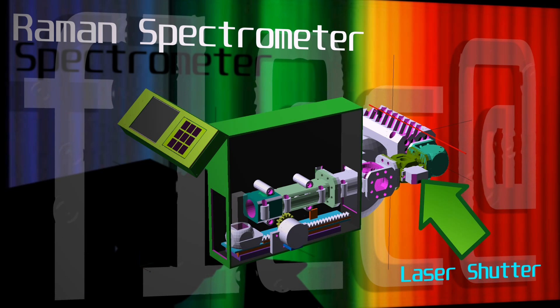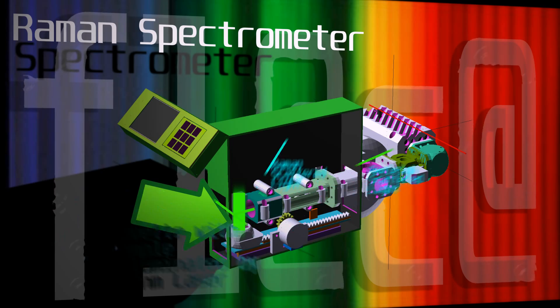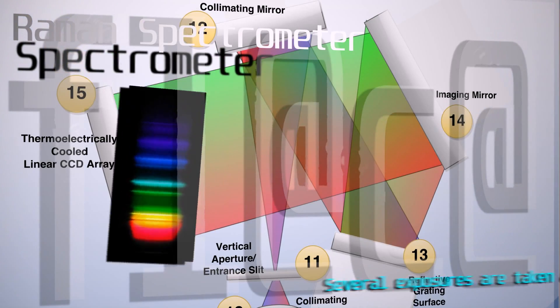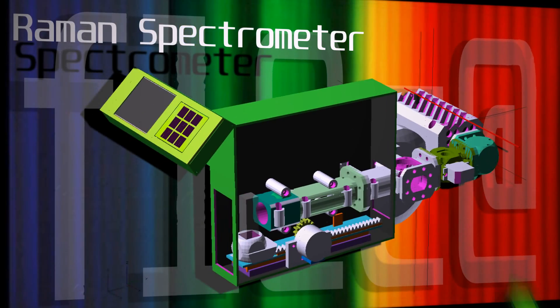Once the cuvette has stabilized, it disengages the laser shutter and exposes the sample to the monochromatic light. The light is scattered and collected, then filtered and spread across the CCD array for analysis. The snapshot is stored on the SD card.